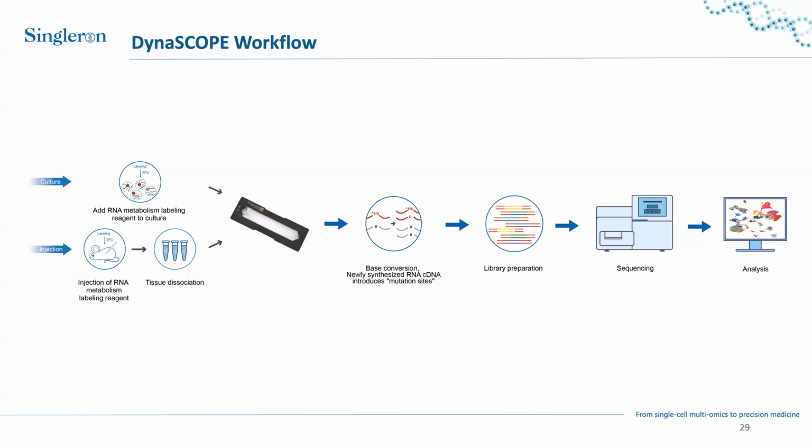If you already know or suspect that your gene is produced very strongly and is very active, then you would go for a shorter time, for example, even half an hour. And if you expect it to be maybe less active, you expect the synthesis to be slower, then you will go for longer incubation.